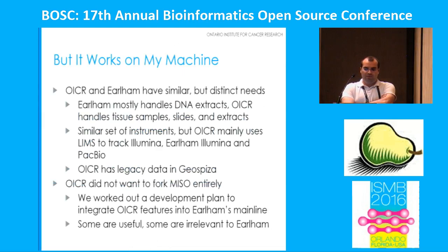So the major problem when you take something that is ostensibly open source but really has only been used by one group, is that it doesn't always just install and work magically in your new environment. We have similar but distinct needs in the way that we handle things. Earlham handles mostly direct DNA given to them by their customers. We tend to handle not only DNA but also tissues. We get bits of people in tubes and then have to do the DNA extraction. A lot of microdissection is another area that we specialize in.